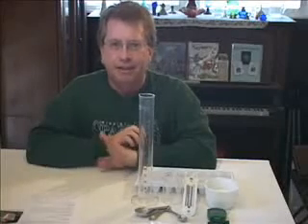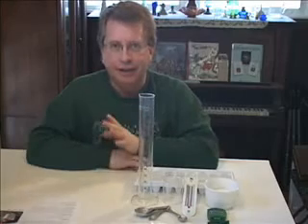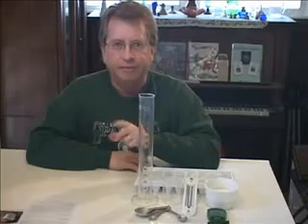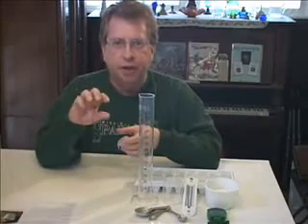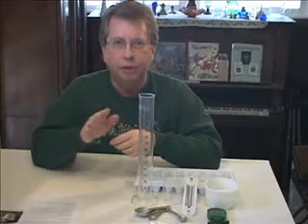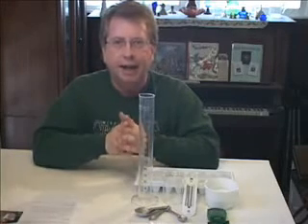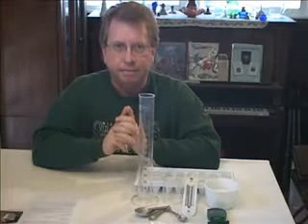Hi there. Today you're going to do a lab that answers the question, how does temperature affect solubility? Now before you do the lab, I want you to do one thing first. Take a small amount of water and pour salt in gradually until no more salt dissolves. Then go to your lab guide and read the material before you do the experiment.